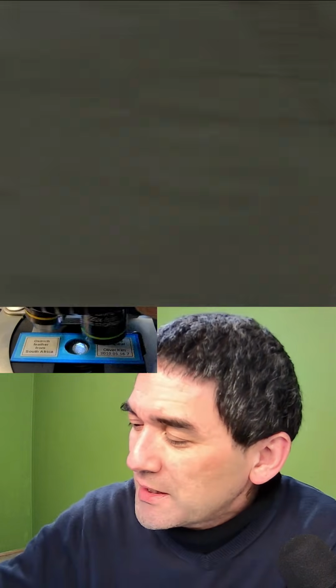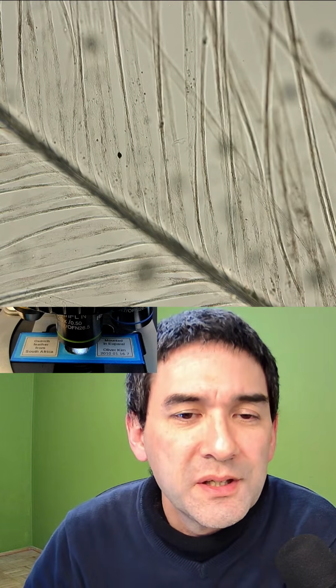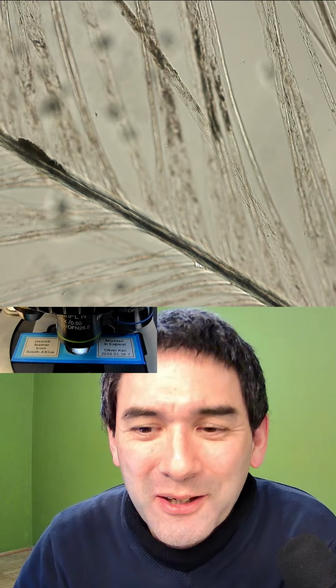Not all specimens look very nice, because sometimes there are some preparation problems, but still they do have some kind of, how do you say, sentimental value, if you want to see it like that.